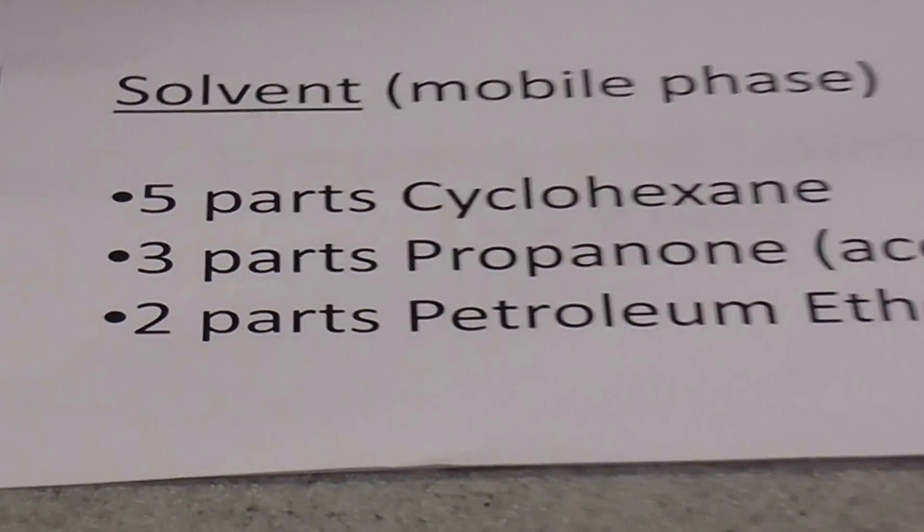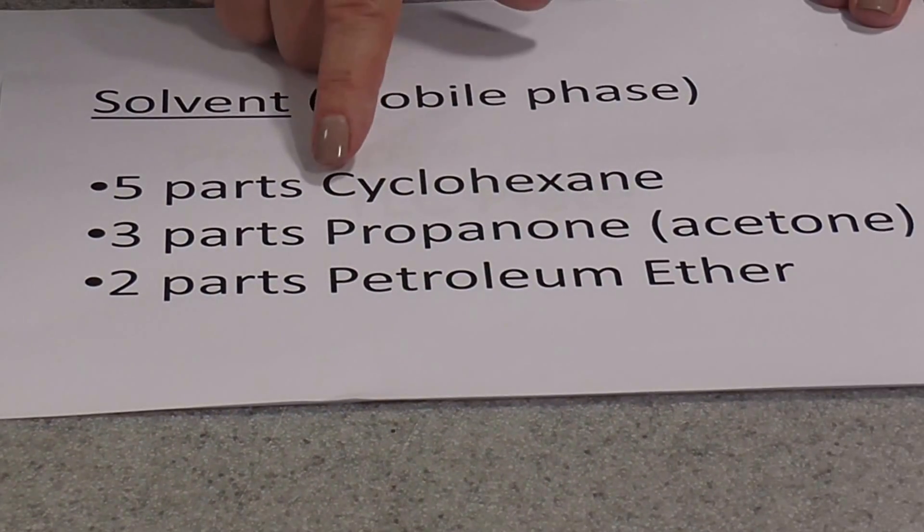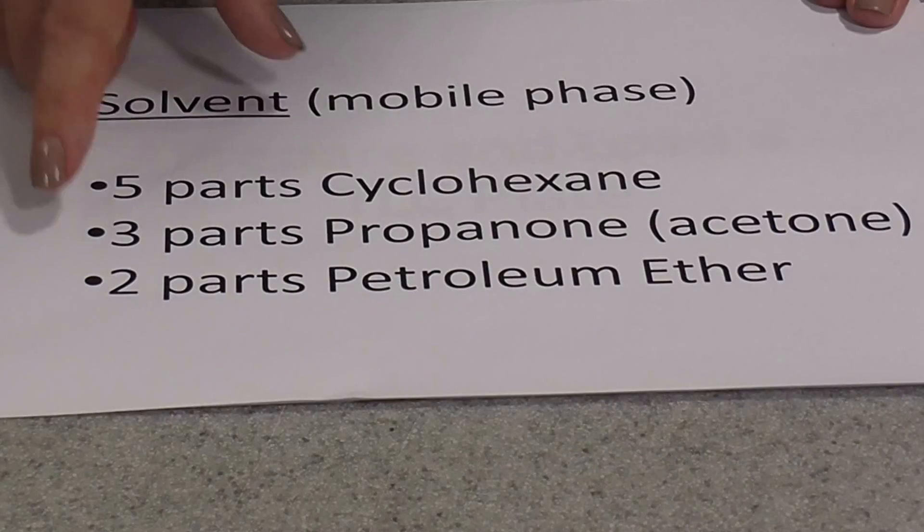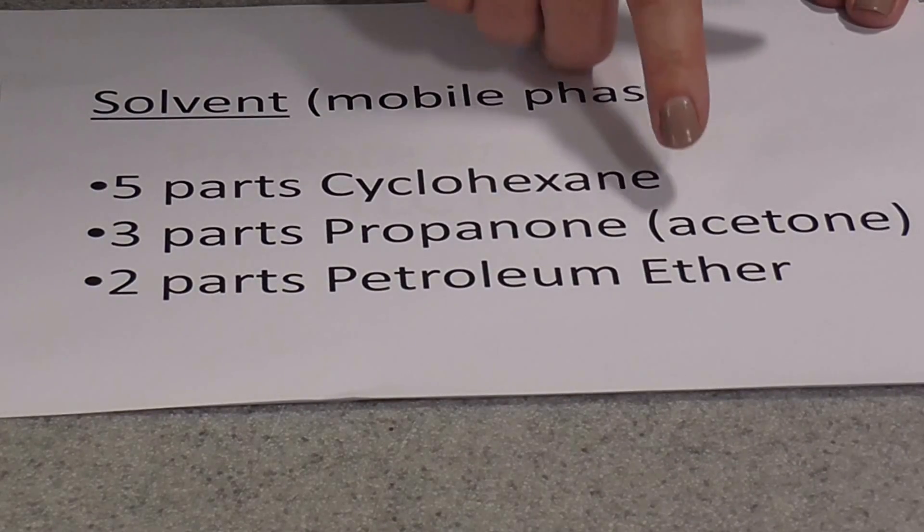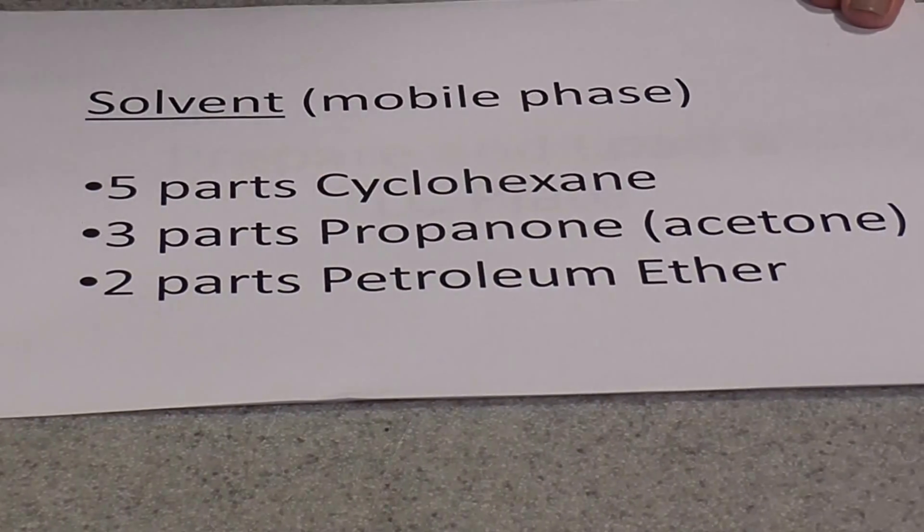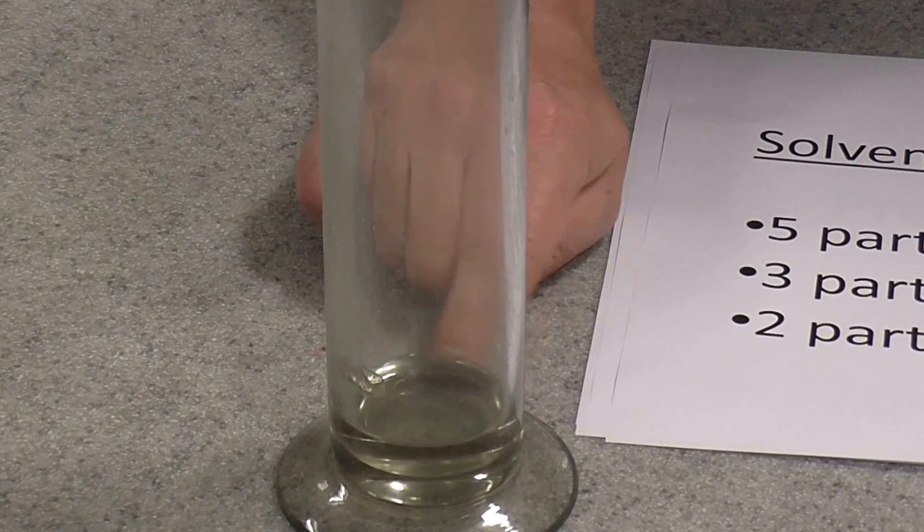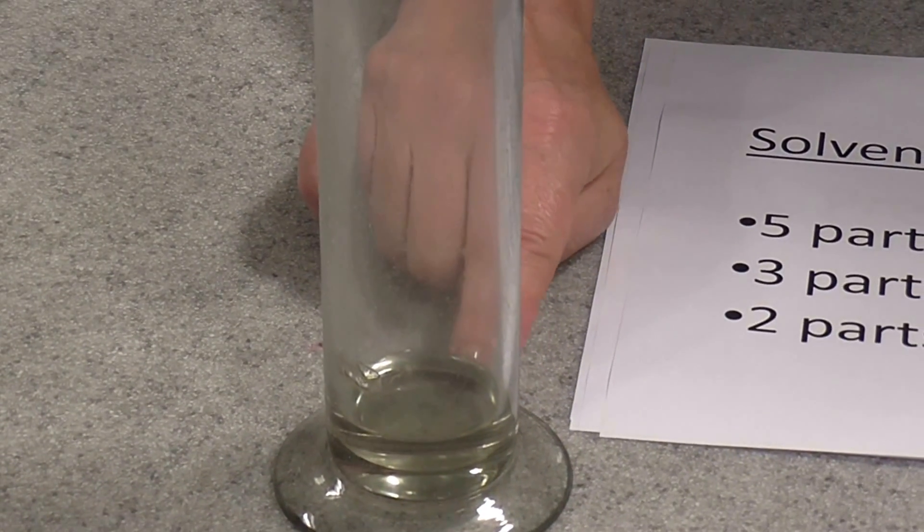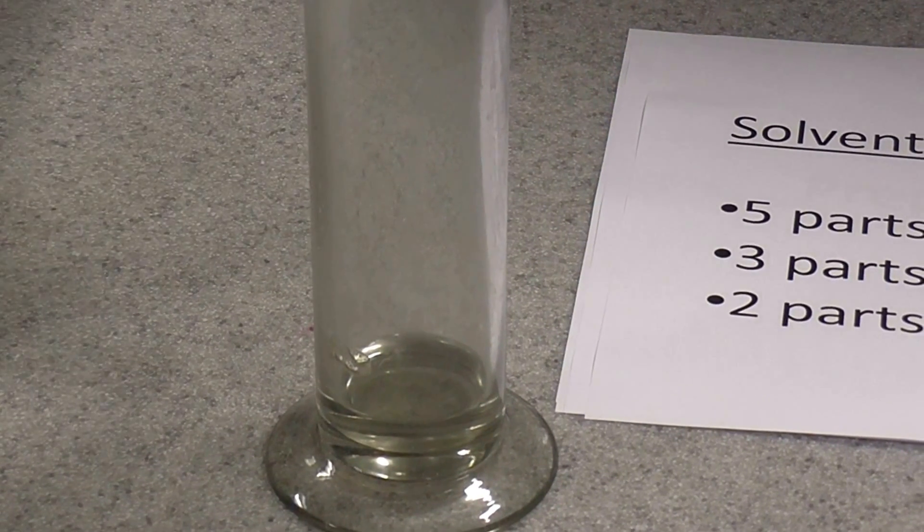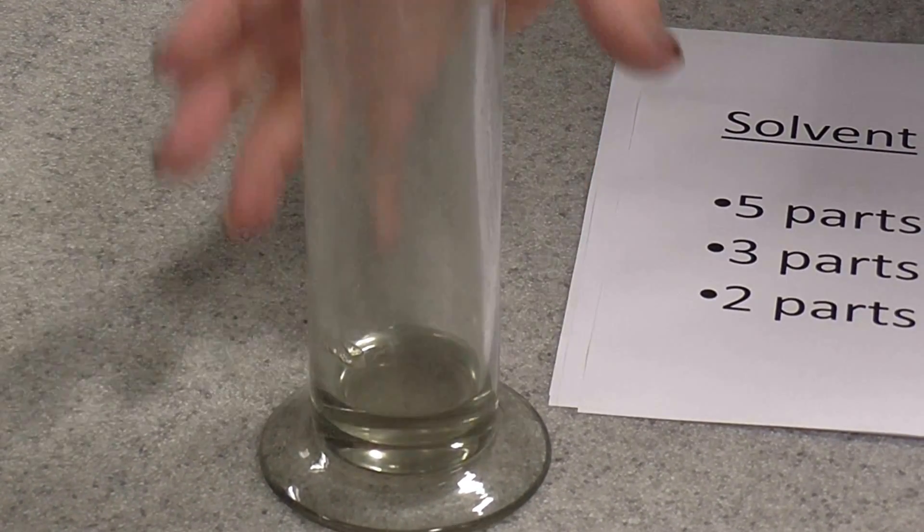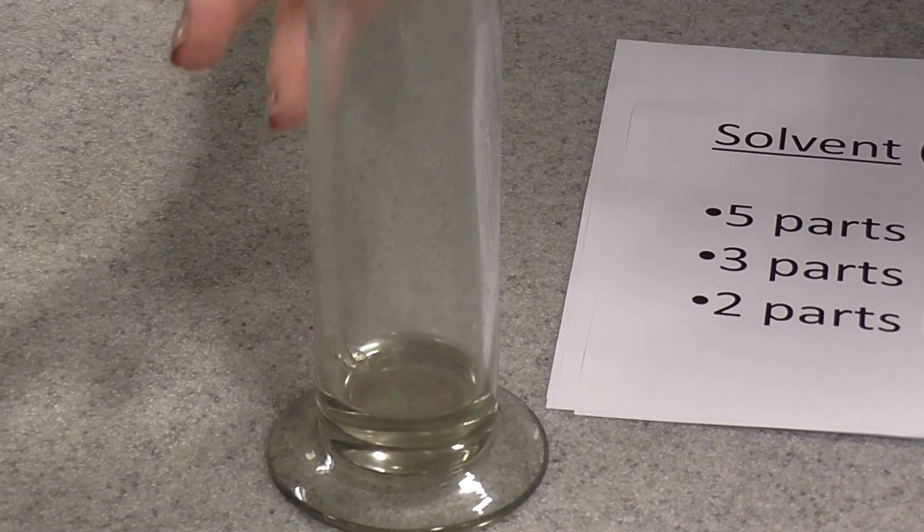Now the solvent in this case is 5 parts cyclohexane, 3 parts propanone, or in other words acetone, and 2 parts petroleum ether. So you need to put a little bit of that about a centimeter deep at the maximum into the bottom of your gas jar and put the lid on so that it's quite volatile and you'll actually get the vapors collecting in here.